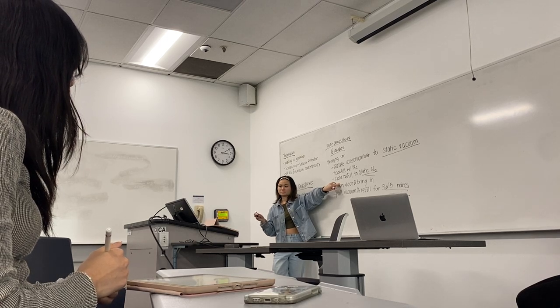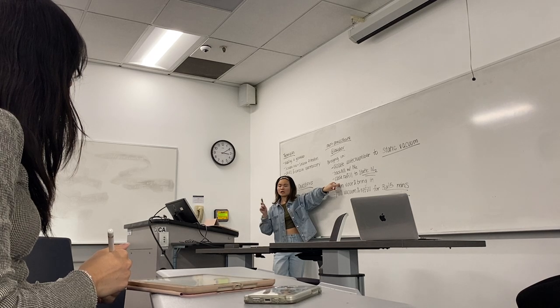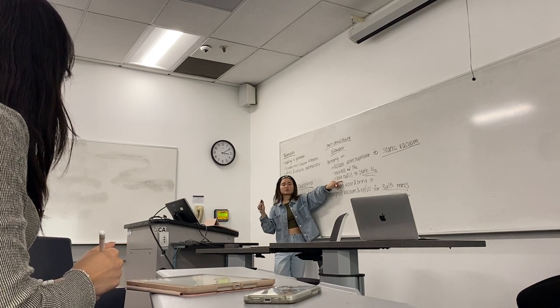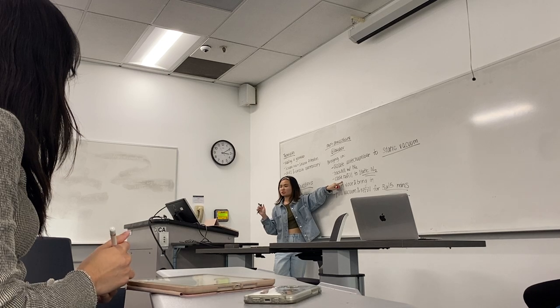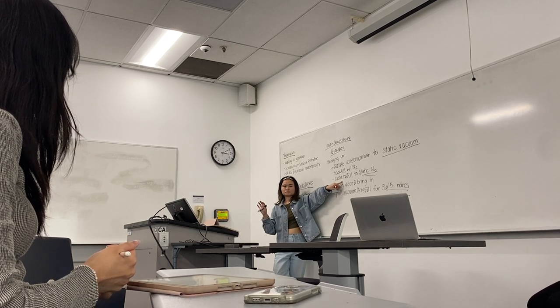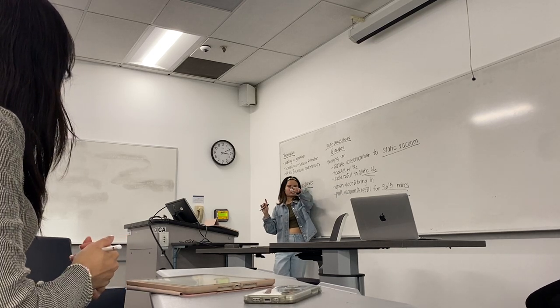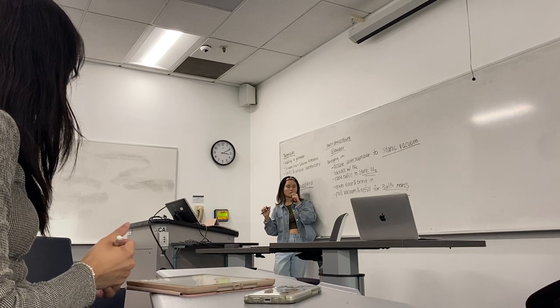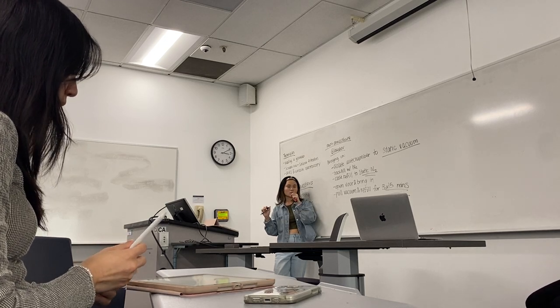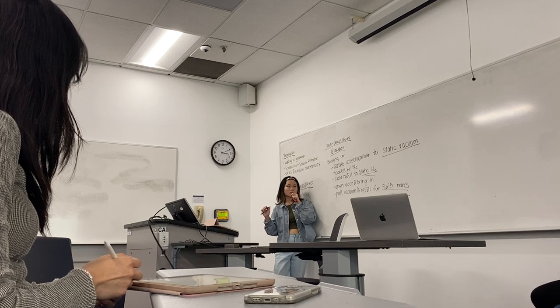Do you want to know the pressure difference between the outside world and the antechamber? Not exactly. We're under static nitrogen. Why not active nitrogen? Close. Is it possible that there's some kind of contamination? There's a closet full of nitrogen and it's a flow system, you just introduce more pressure.